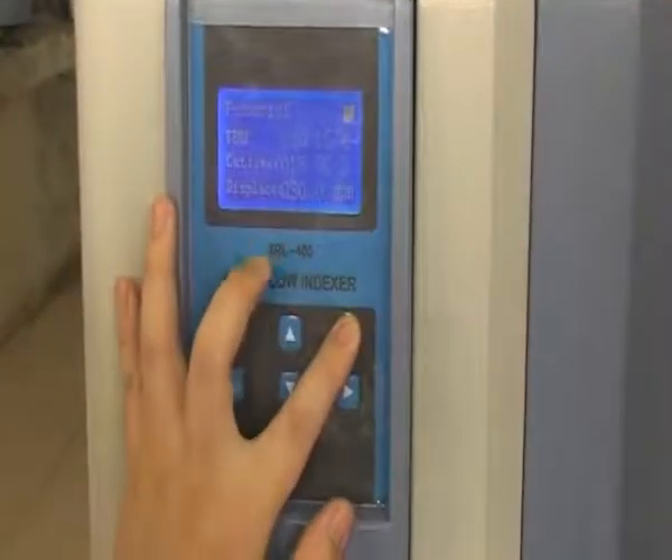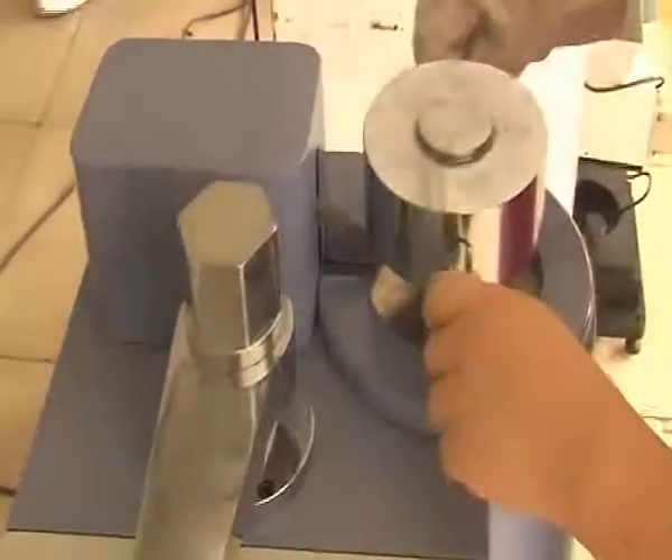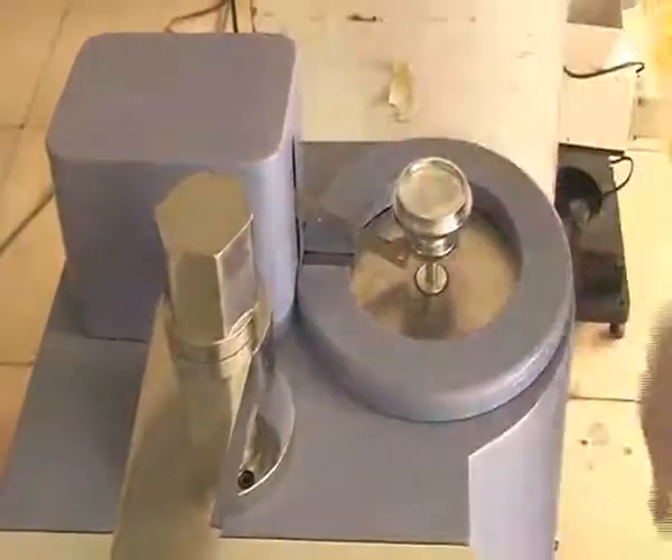Press exit to return to the finish interface. Press exit for a few seconds to start a new test. Finally, press exit to return to the finish interface.